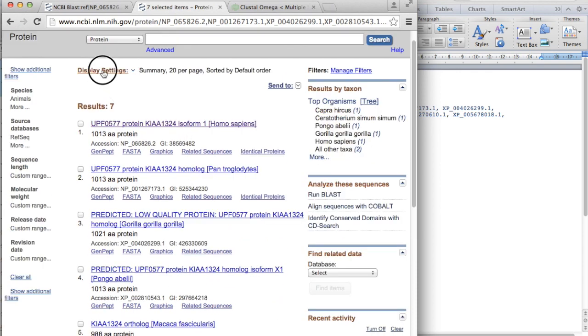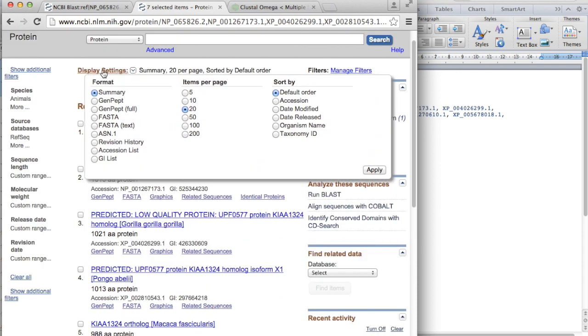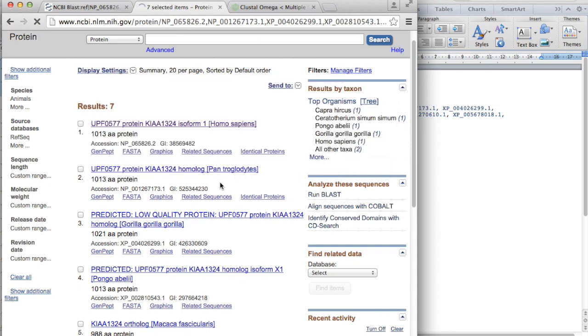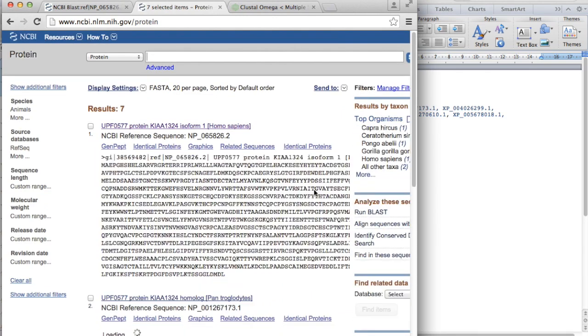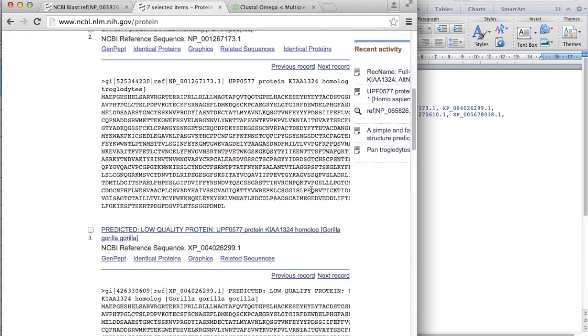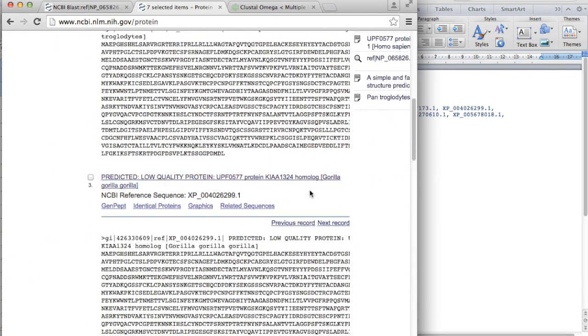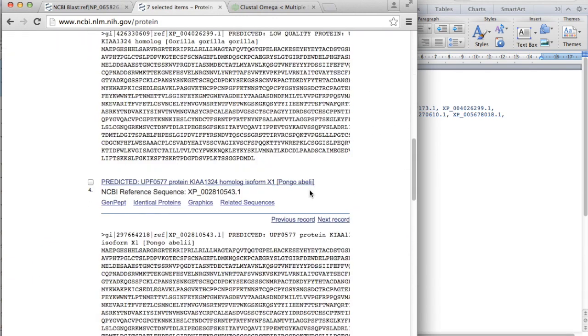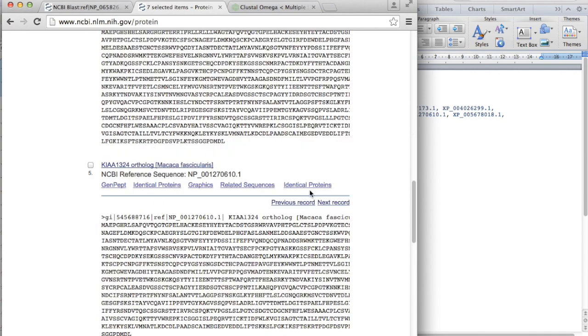And click display setting and get the FASTA format and click apply. And you have here all the FASTA sequences of these organisms.